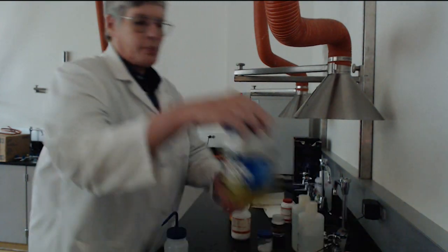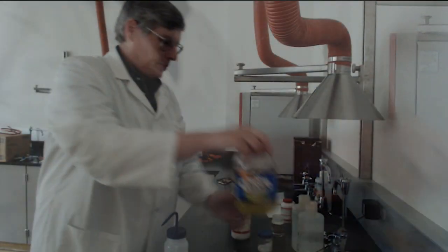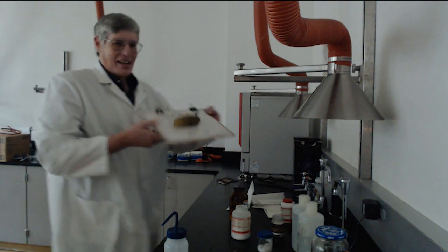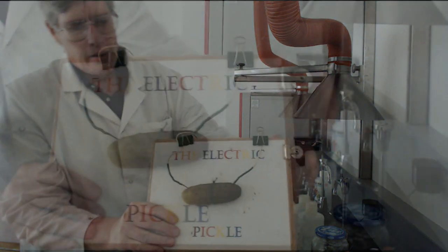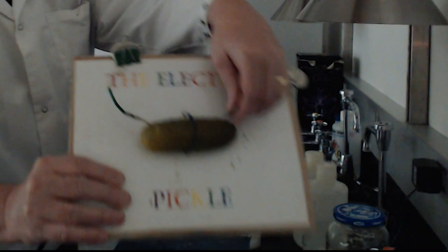Now, the last thing that we like to demonstrate today is electric pickles. Can you see the label? We have electric dill pickles. Dill pickles are prepared. I have here strapped to a piece of cardboard a pickle that I took out of the jar. I have 2 wires that are stuck into it.